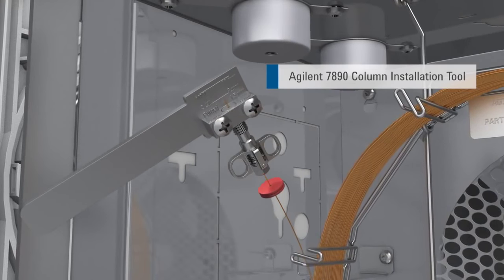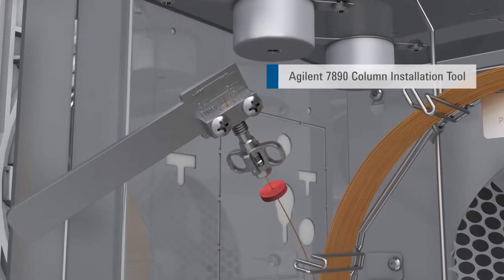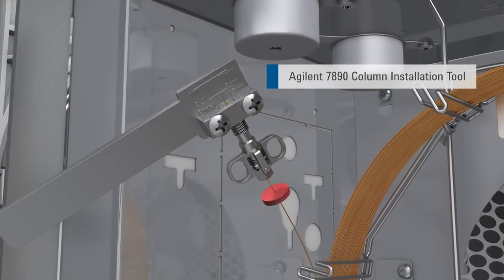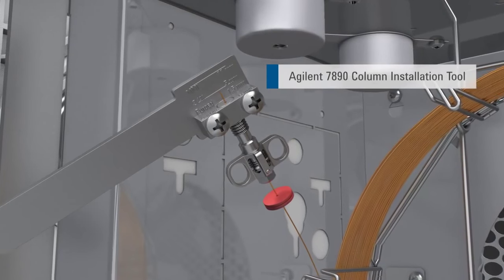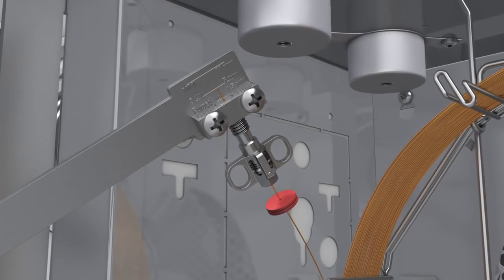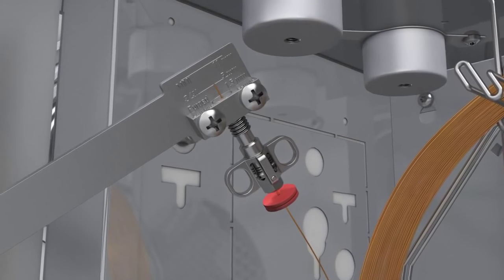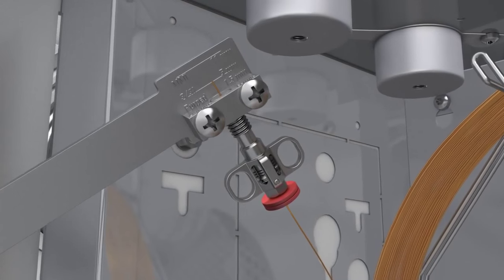A column installation tool to pre-swage the ferrule onto the tubing improves consistency. Because soft graphite polyamide blend ferrules can still be moved after pre-swaging, slide the septum beneath the column nut to hold the nut in place.